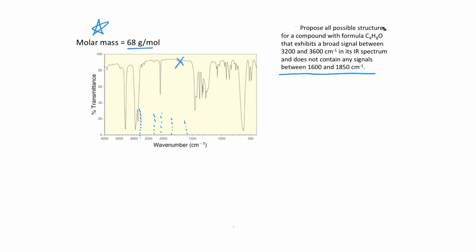There's really nothing in the double bond region, but I think this is pretty indicative of a triple bond, and that's likely a CC triple bond. Given no other information, that's a good place to start. And so there's either a possibility of having carbons on either side of that, or having a hydrogen on one side. And so we should look for potential stretch of that CH bond on an sp hybridized carbon.